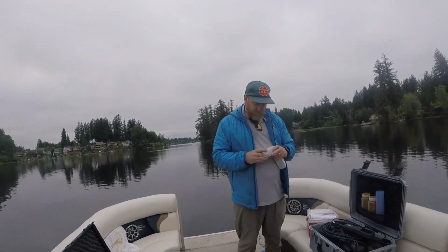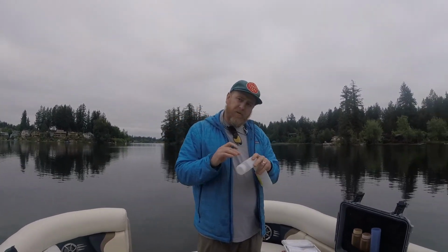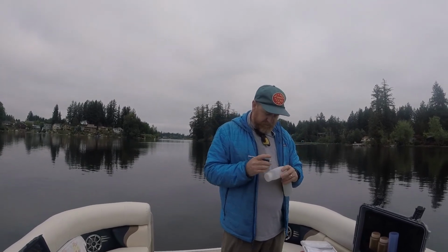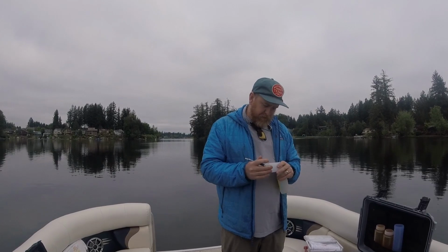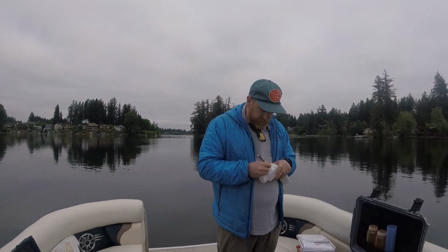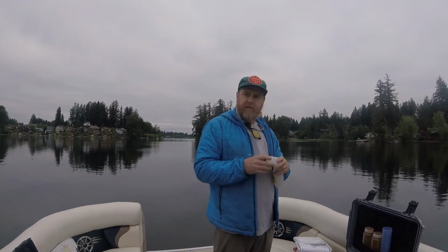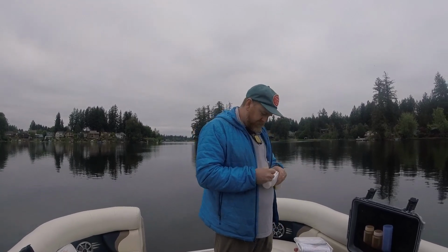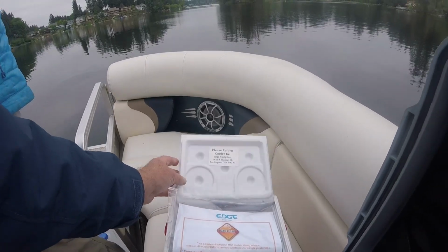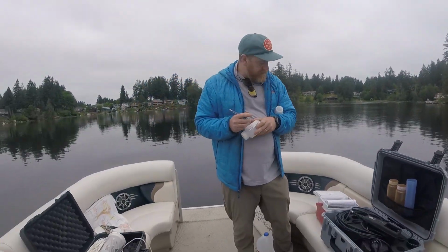And the sample bottles you order from the lab. You request them, they'll send them to you with the cooler, so that you don't have to. And what lab are you using for this? We use Edge Analytics. They're out of Burlington, Washington. Okay. So they're doing all your water testing at one place? The sample analysis of it. And so for phosphorus, they put the sulfuric acid in it for you already.